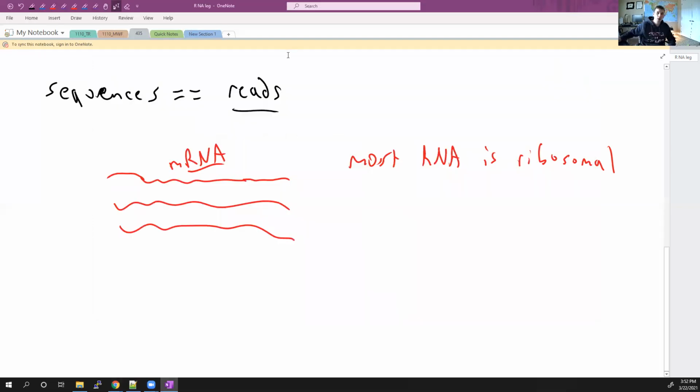And we isolate the mRNA, because we always have to remember that mRNA can be differentiated from the ribosomal stuff because it has a poly A tail at the end of it. The polymerase will add a poly A tail to protect the mRNA from degradation as it enters the cytoplasm. I don't know if I mentioned this before, but RNA behaves a whole lot like wet toilet paper.